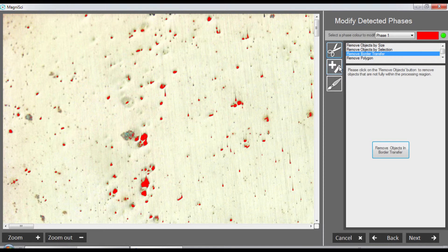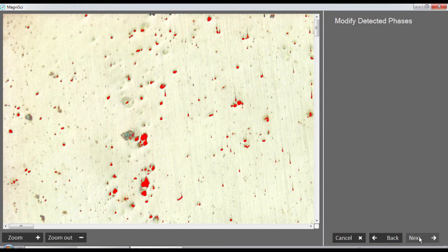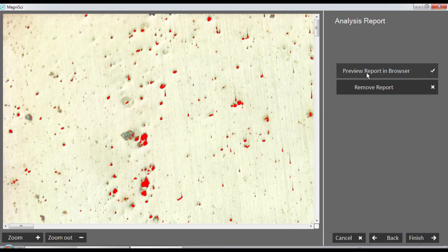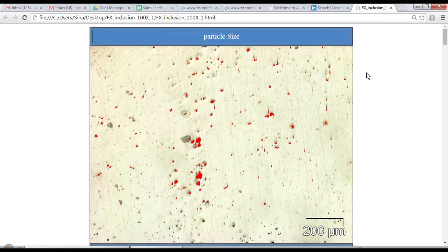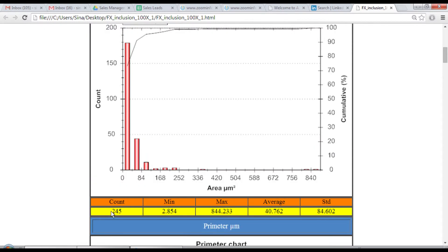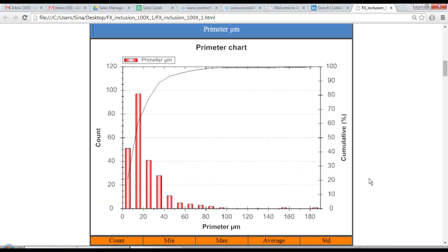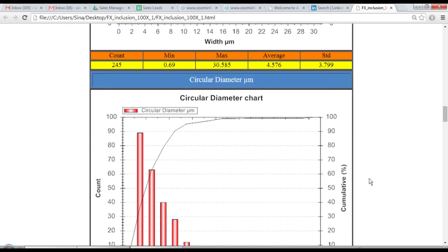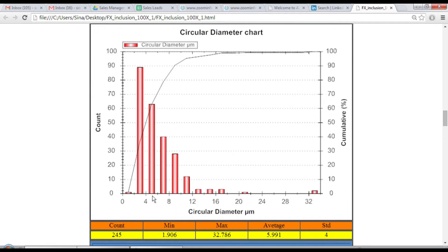Let's generate an initial report - the software immediately does the measurements. In this case I have my phase, and here I have 245 objects being counted. This is their circular diameter chart, which is what I'm looking for. The average is 5 microns and there are 245 of them.